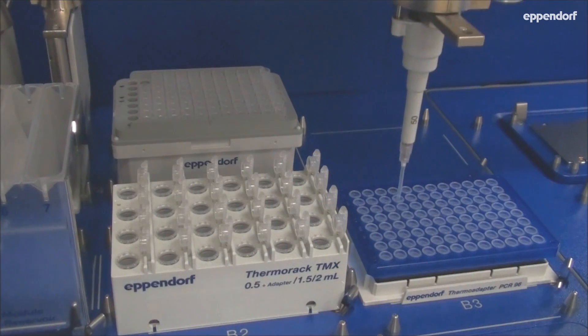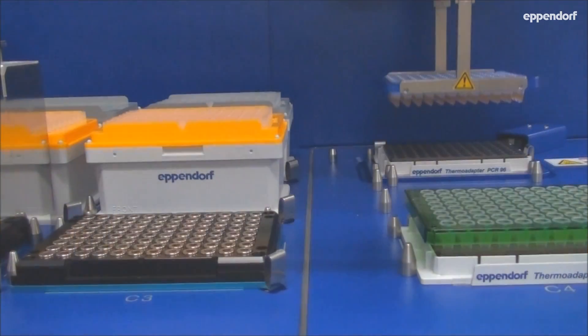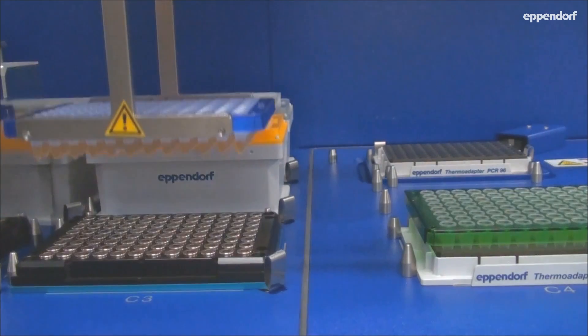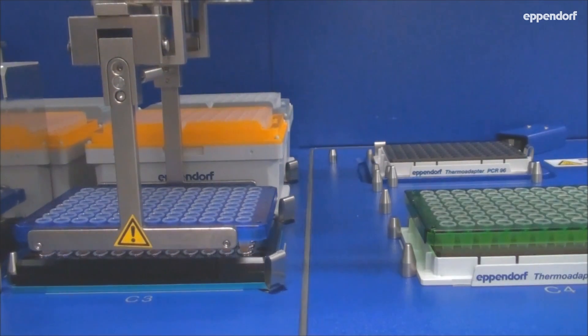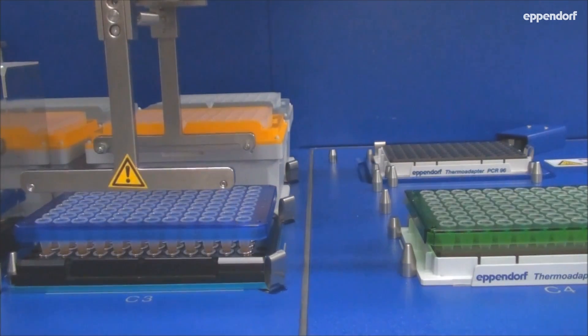Each segment of the sample preparation includes the magnetic bead purification step. During the purification, the sample plate is transferred to a magnet where the beads can be pelleted, washed, and eluted from.